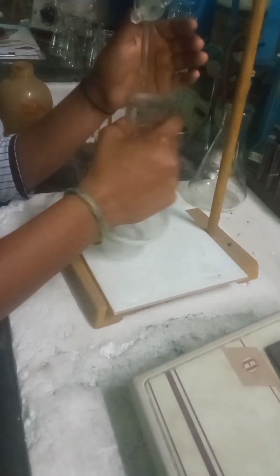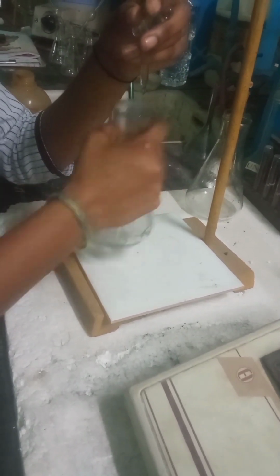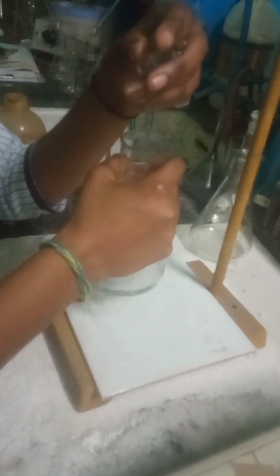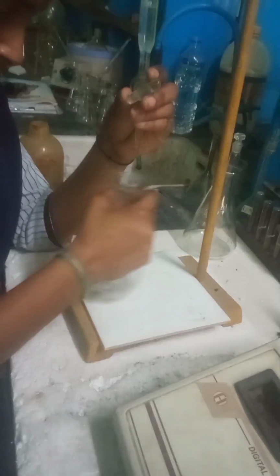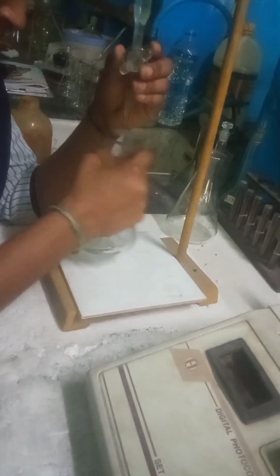The weight of acetic acid adsorbed on the surface of charcoal is considered as X. If it is divided by the mass of charcoal added into the standard flask, the efficiency or the intensity of adsorption can be derived.